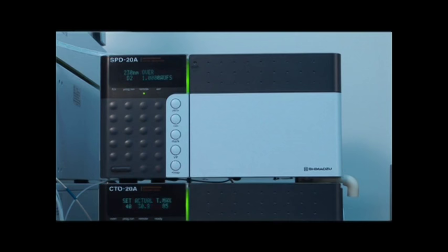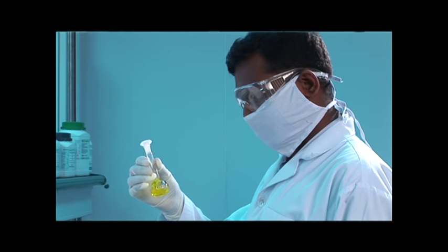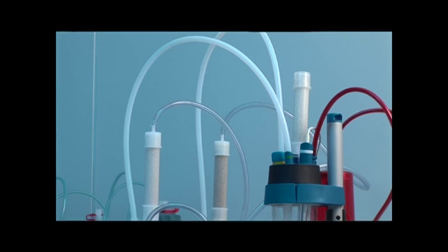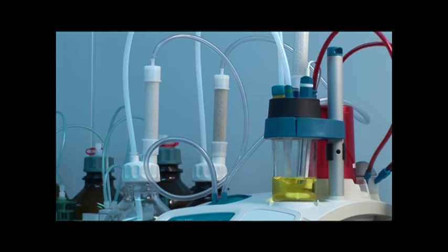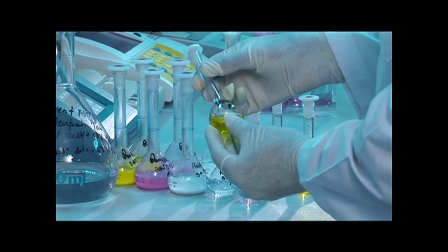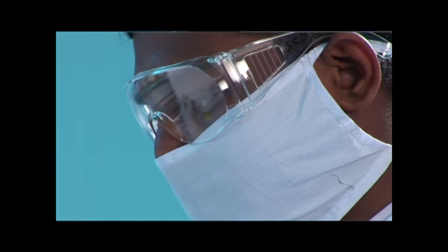Beacon uses the most modern water system as per United States pharmacopoeia requirement which shall be procured, installed and validated from reputed European source.